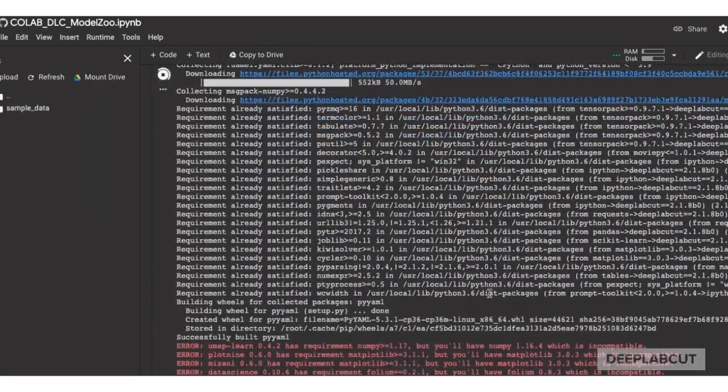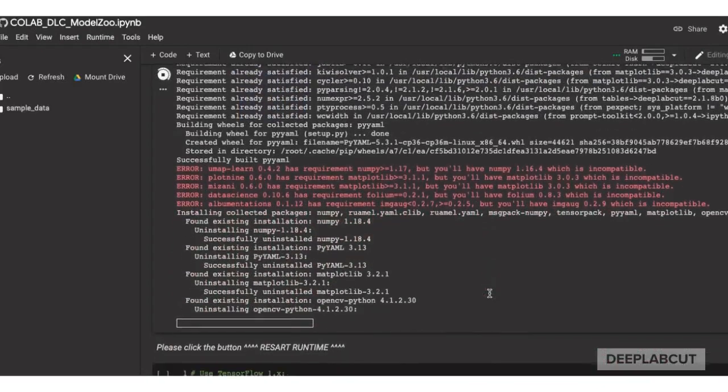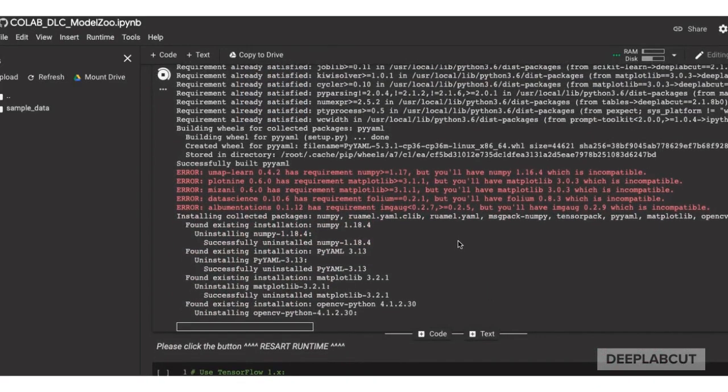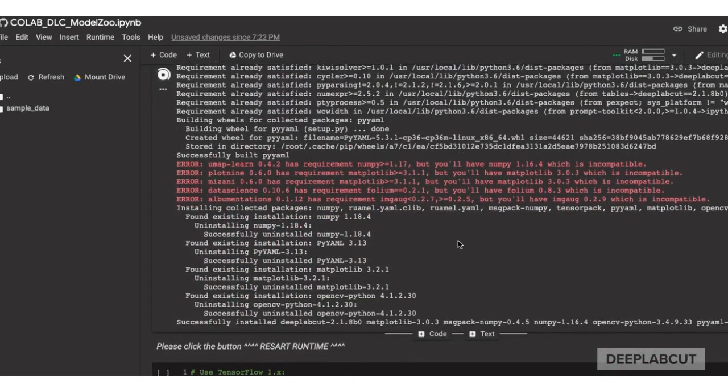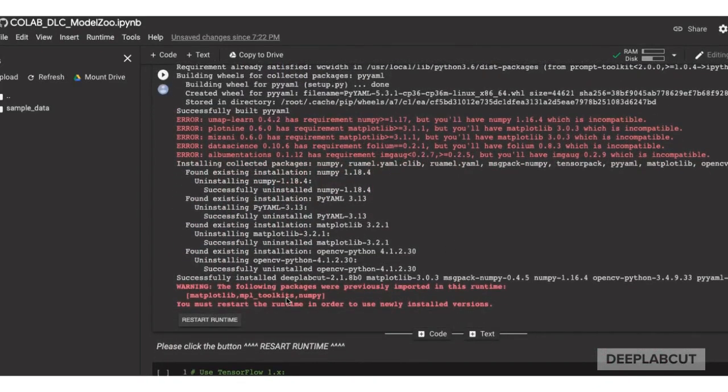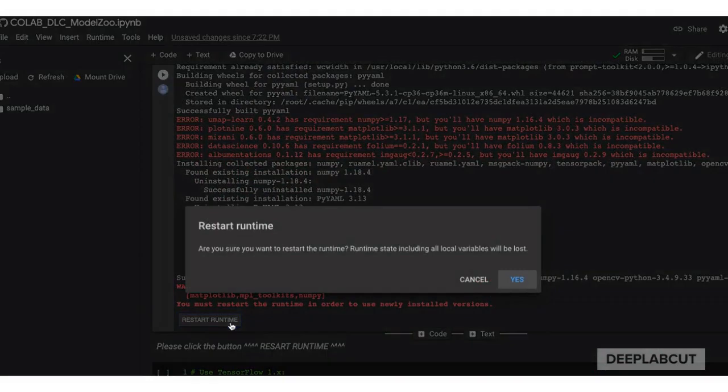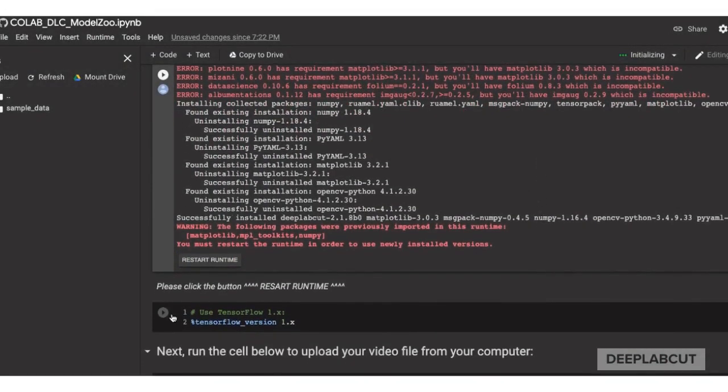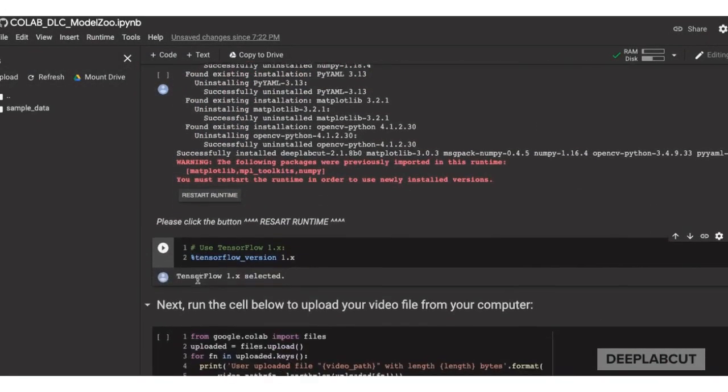As you saw, I simply launched the notebook by clicking on the blue button on the website, made sure I was connected to a runtime, had access to a GPU, and you simply can start clicking through the notebook to get everything installed and upload your video.